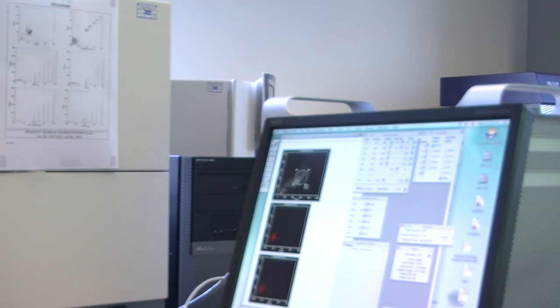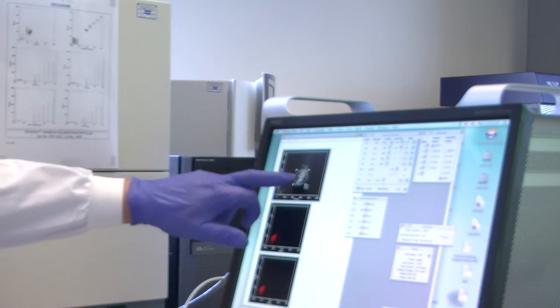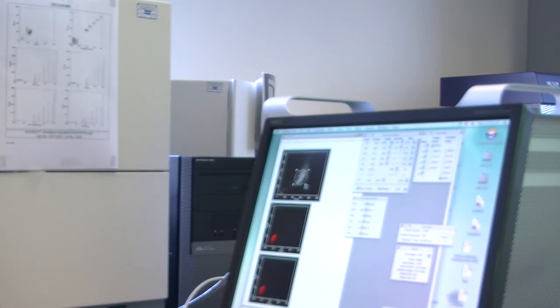Right. Cool. Okay, so those settings are fine for all of our samples. So I will use these settings now for all of our samples. So what we'll do, we'll first run the negative control cell with the isotype match control. So untick setup, click on acquire, and we should get 10,000 events. Now what you can see is you've got a nice single population of forward and side scatter cells.